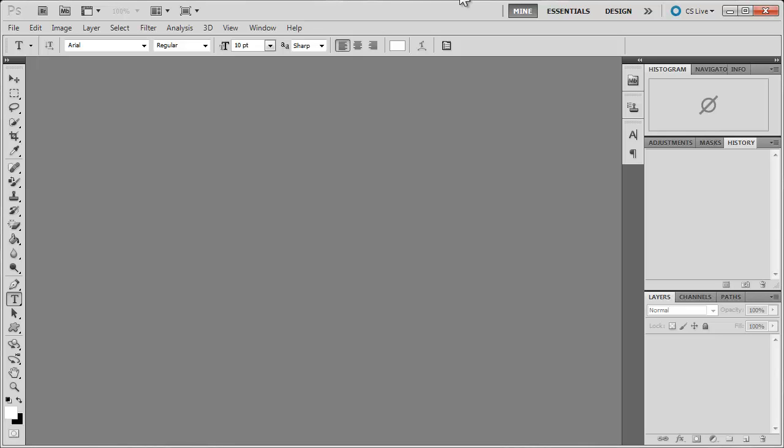In this video we are gonna work with the very basics of image editing in Photoshop. We're gonna work on an agarose gel in which we're gonna practice cropping the image, straightening it, and labeling. And so that would allow us to work with layers, the crop tool, the align tool, and others.